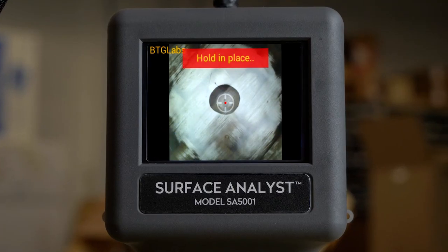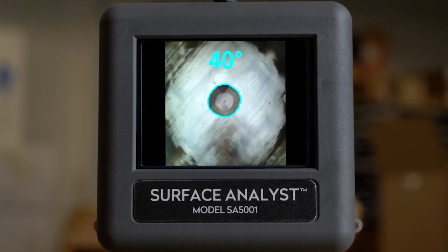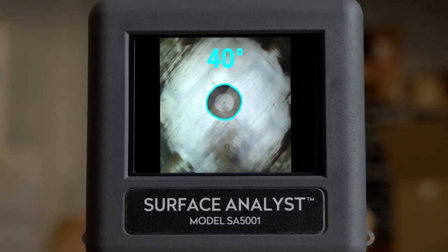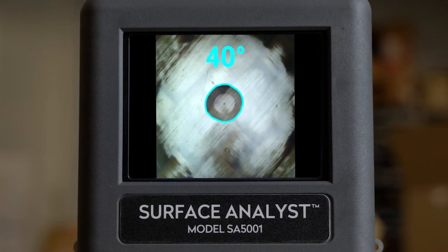The 5001 features intelligent dynamic detection, a combination of advanced vision tool sets capable of exceeding the accuracy of laboratory goniometer contact angle measurements.